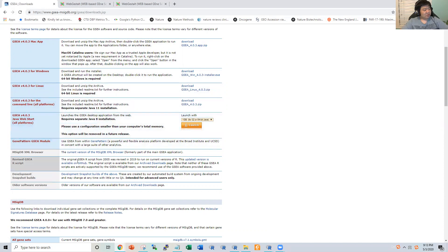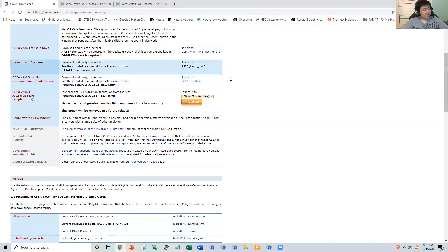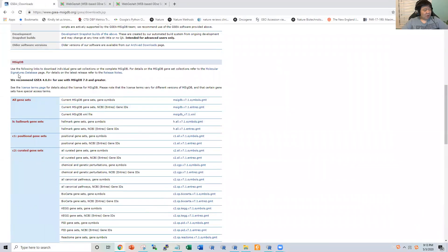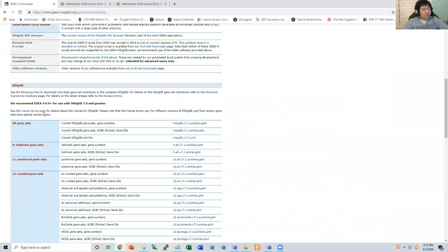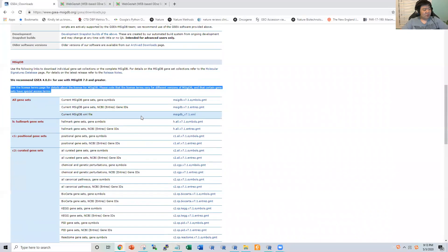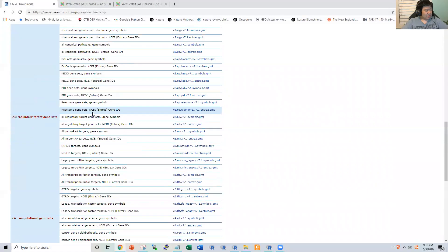I have only used the Java version and R functions, so today we are going to majorly talk about the Java version. The second part is the MSigDB, which is the molecular signature database. In this database, they keep updating it. Recently, they updated the version to version seven with different types of gene sets. So here I would like to first spend several minutes to talk about the pathway resource available here.